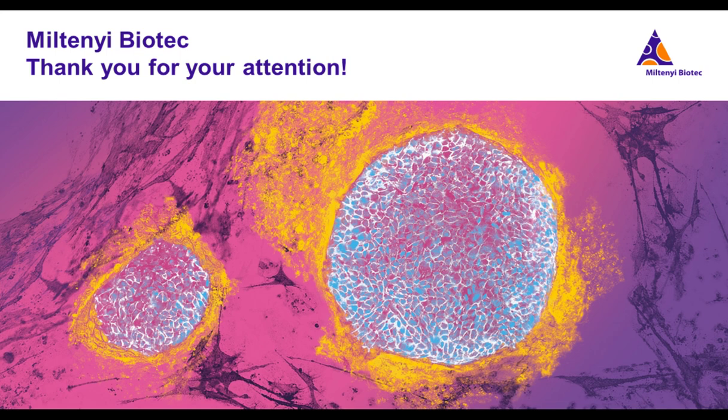If you were staining several tens, maybe 20, 40 antibodies simultaneously, there is quite some risk that there is some interaction or competition between those antibodies, since we are just staining every antibody in the cycle which we want to acquire only in this cycle and not directly in the beginning. We do not face such an issue.